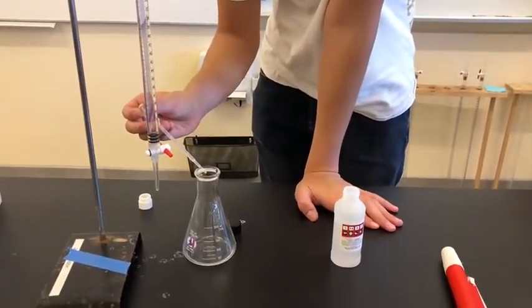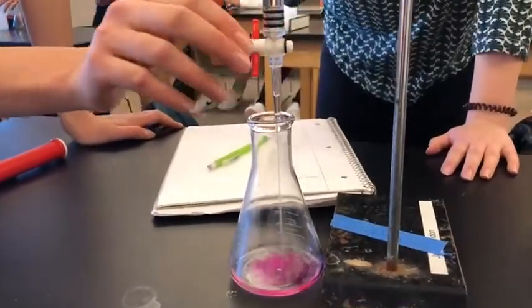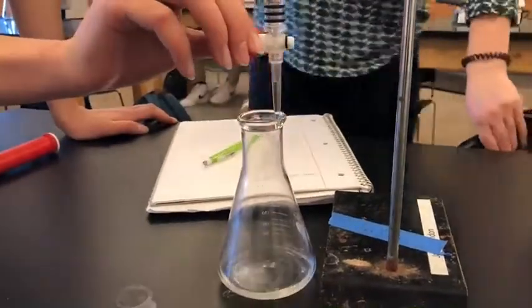Step 7. Record the starting volume. Step 8. Start performing the titration by letting the base run through the burette and into the flask. Stop when the acid changes the color completely.